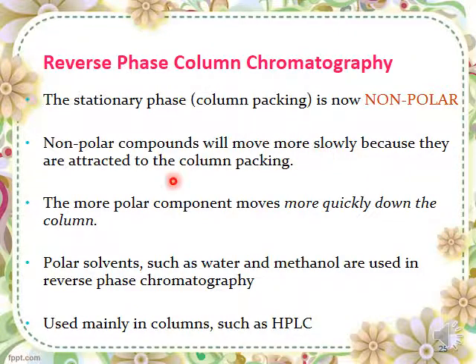Polar solvents such as water and methanol will be used instead for reverse phase chromatography. These are used mainly in columns, for example, high performance liquid chromatography (HPLC) for reverse phase chromatography.